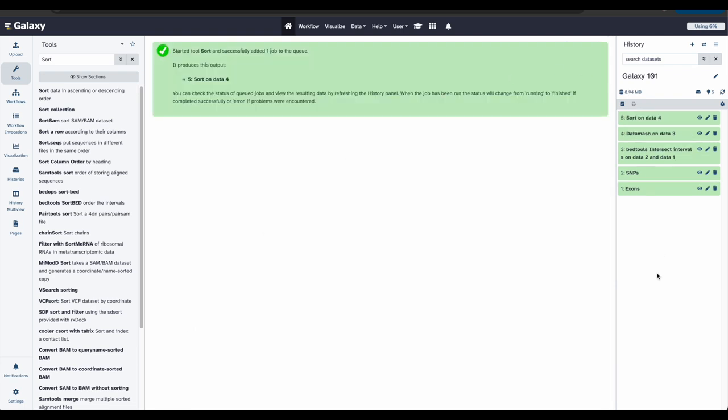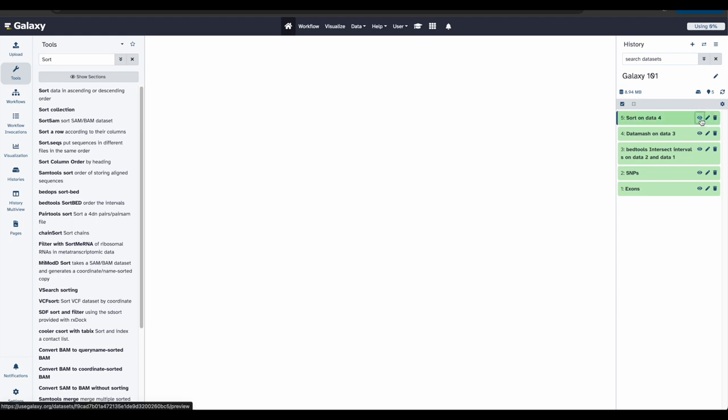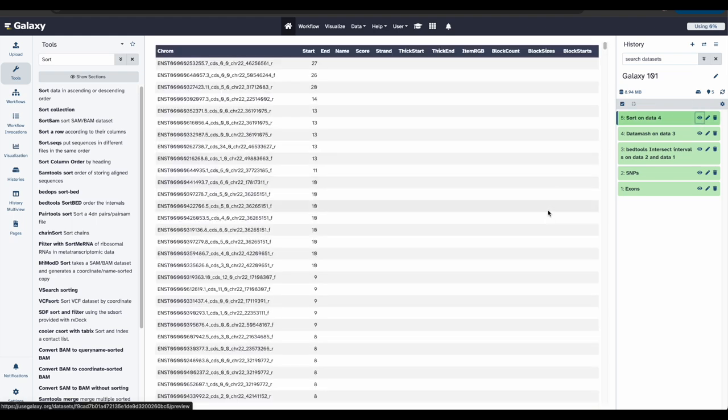The tool has run, so let's examine the output file. The file will look similar to before sorting, but now the exons with the highest number of snips are at the top.